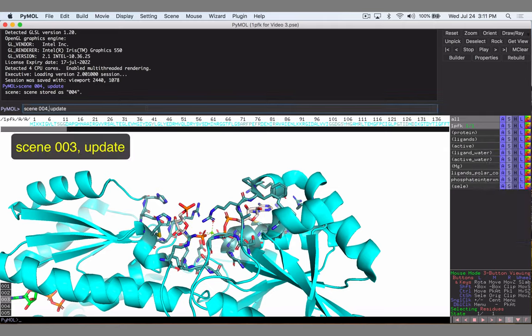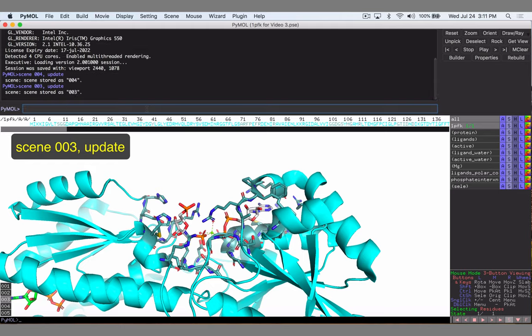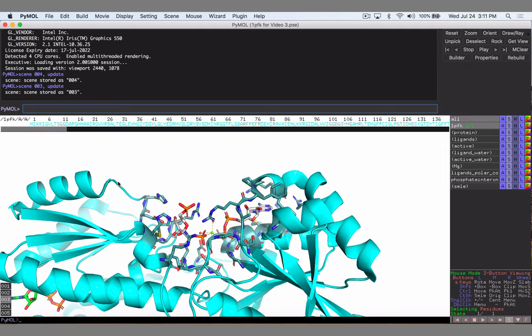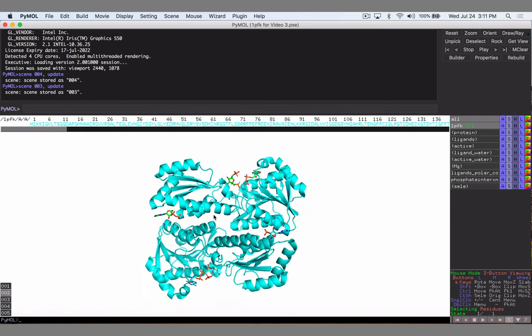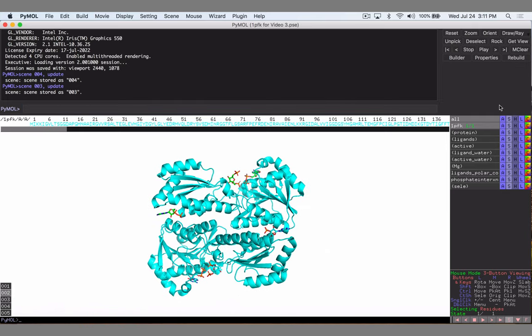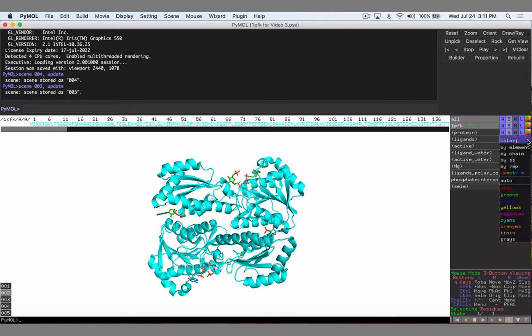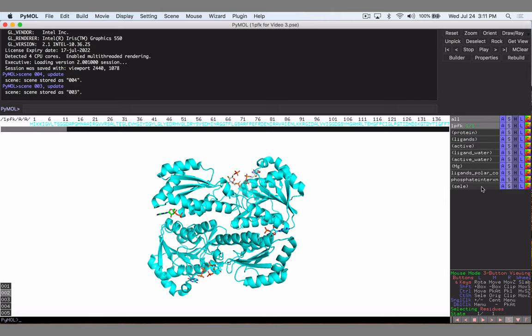And now click in the command line, click the up arrow and we can quickly just change this to scene 3. Same command comes through so we're using the arrow keys to toggle through those commands. Now let's go back and see what we had for scene 2. Our ligands were green so let's color them by element and change them to white.